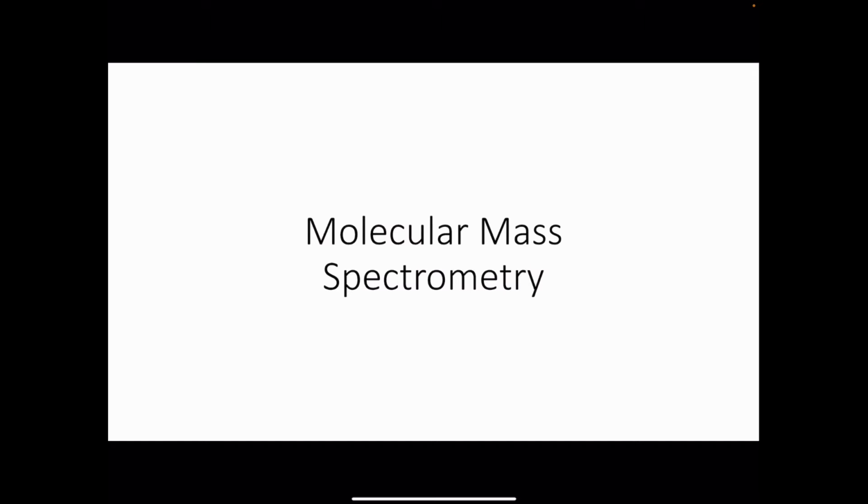Hi everyone! In this video we'll be exploring molecular mass spectrometry. In addition to elemental analysis, like we were just looking at previously, mass spectrometry is very widely used today to study the structures of inorganic, organic, and biological molecules. It's also capable of determining both the qualitative and quantitative composition of complex mixtures.